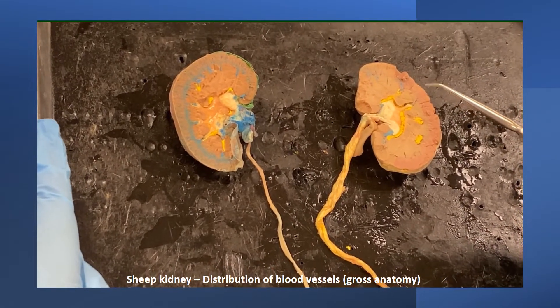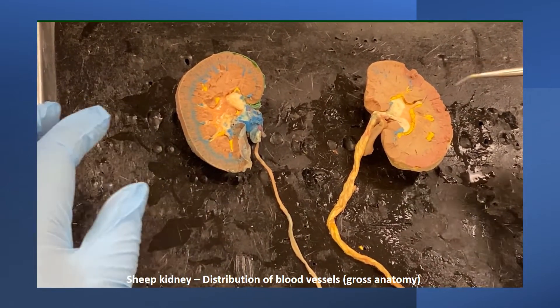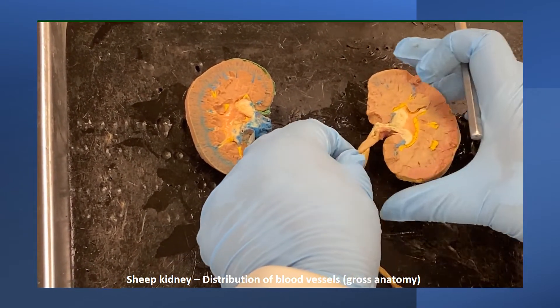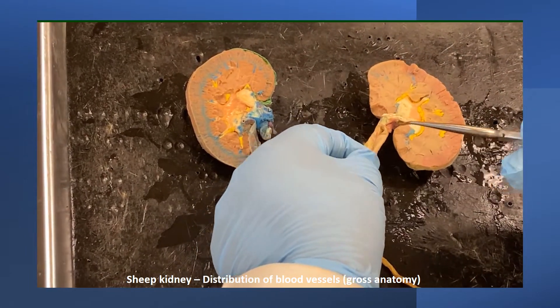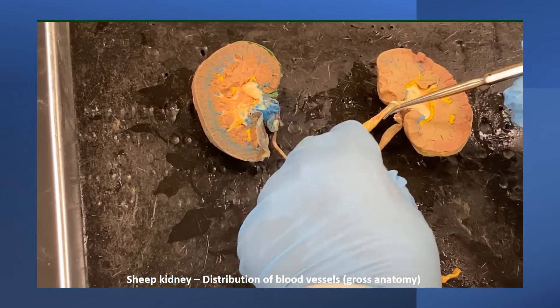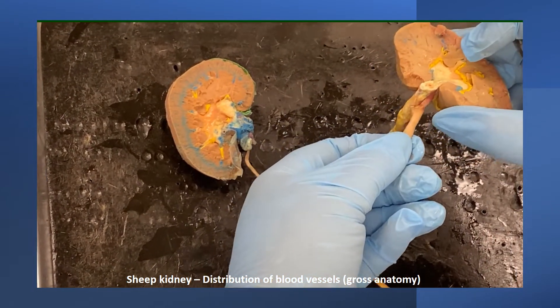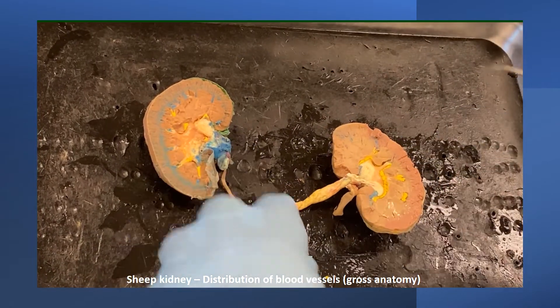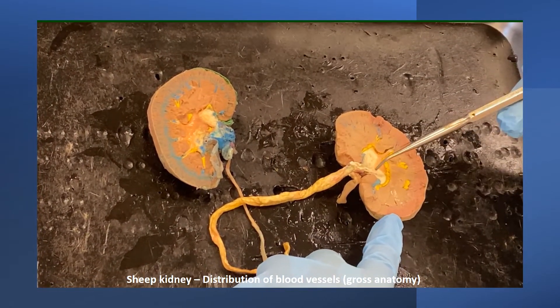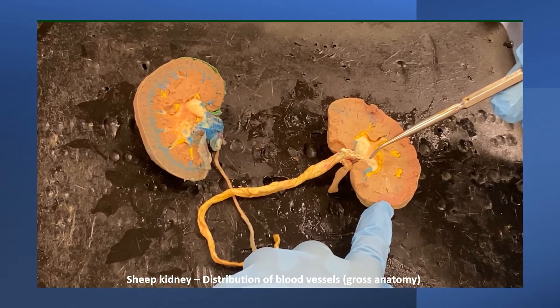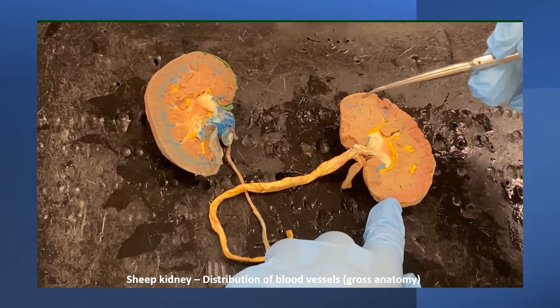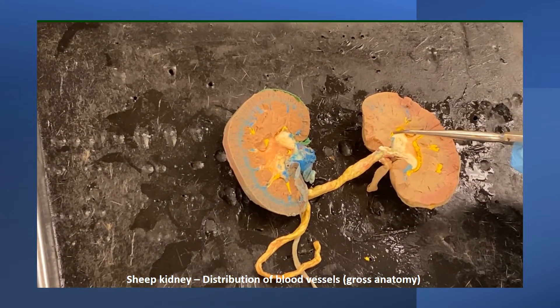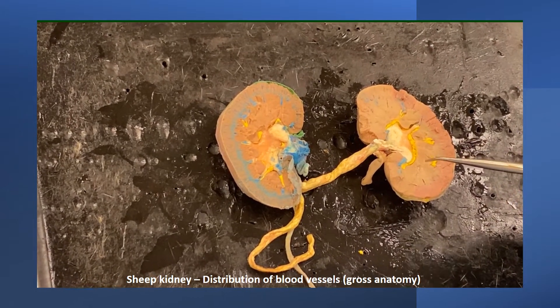In this segment, we will look at the blood distribution inside the kidney. First, the renal artery branches going inside the kidney — here is the ureter. If you look carefully, you will be able to see the elasticity of the artery. Once the artery goes inside the kidney, the very first branch comes off — that is the segmental artery. The stains are not that distinct, so you might not be able to differentiate the segmental artery, but that is the first branch from the renal artery.